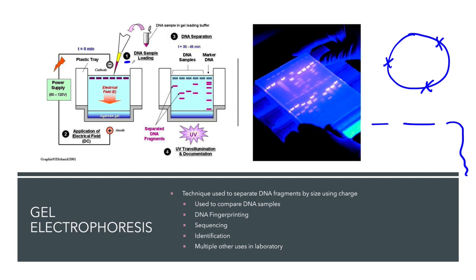So on the left, I have my gel and I take my sample. In step 1, I've exposed my DNA plasmid to restriction enzymes. I've allowed the restriction enzymes time to do their thing to all of the millions of plasmids that I have in this little tiny tube. I'm going to take some of that sample that has been cut with a restriction enzyme and load it in some wells that have been molded into the agarose gel.